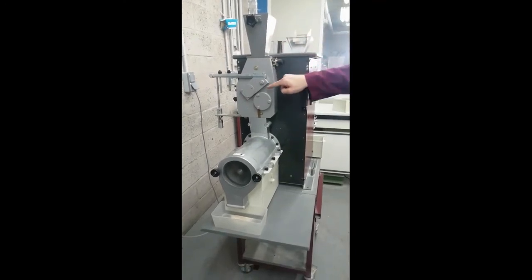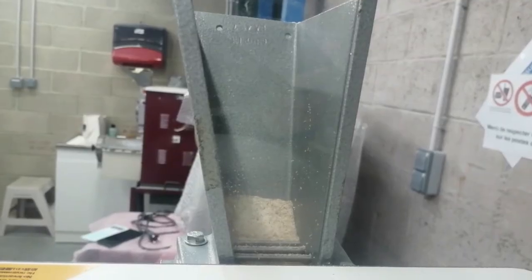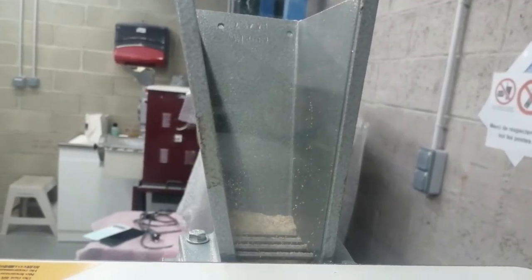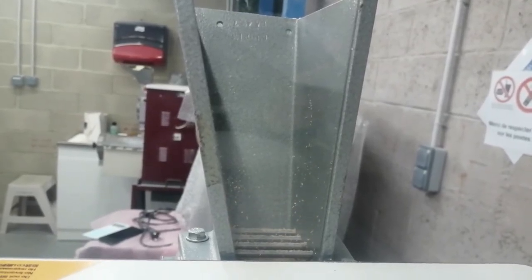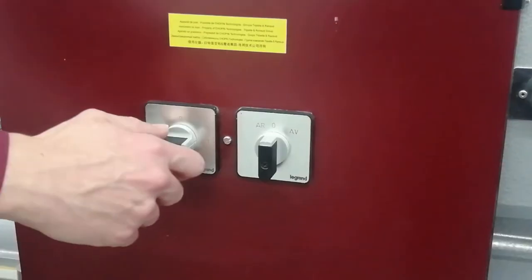The middlings are reduced between two smooth cylinders and sieved on a rotating sieve. Once the last grain of middlings has passed, wait about three minutes to let the sifting end, and stop the machine.